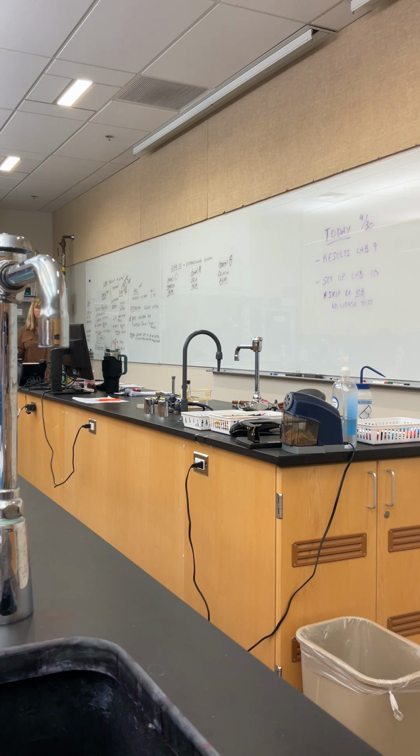Now, how did our Staphylococcus do on this plate? Did either of the staphs grow? No. And hopefully that makes sense, because remember, MacConkey has some dyes in it, right? What was the dye that we mentioned was in it? We've used it before. Neutral red. Well, not neutral red, that's a pH indicator. Remember, it has crystal violet.